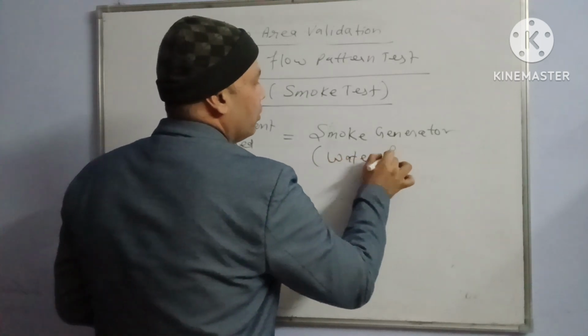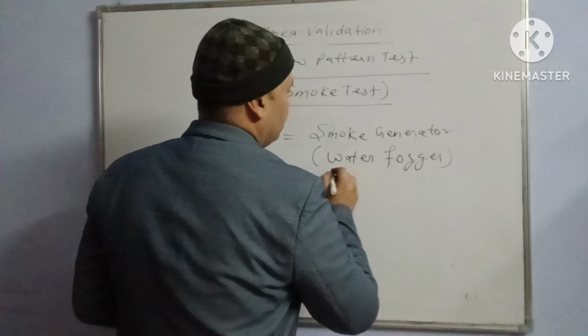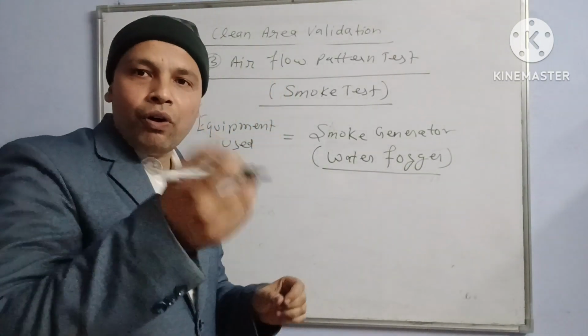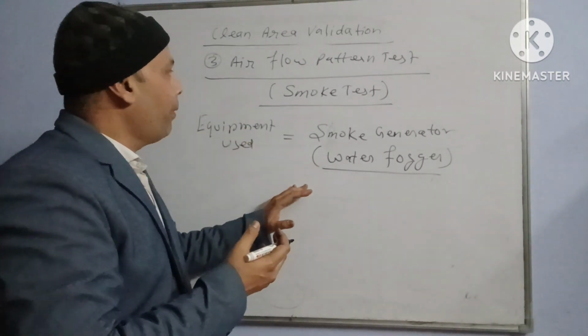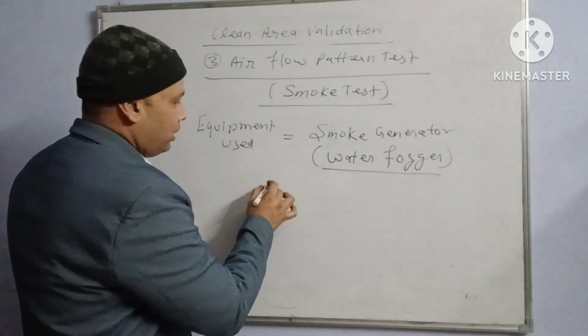These generate fogs or mist of water, and white color fumes are coming. By this we are checking the airflow pattern. It should be unidirectional.